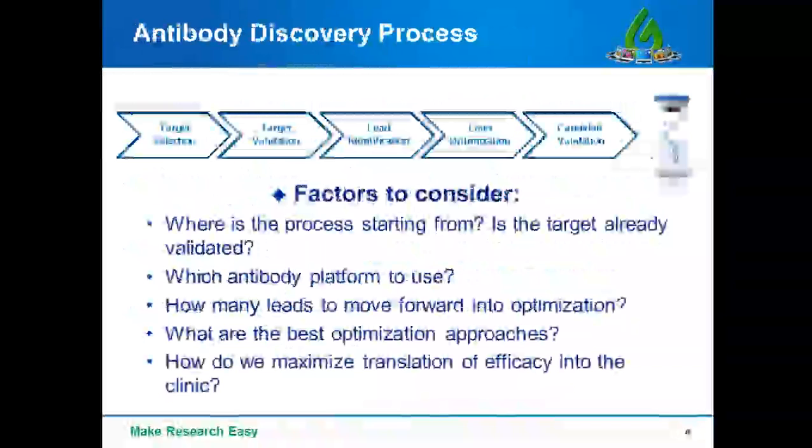Even before animal immunization, plans and preparation of multiple screening methods need to be in place. Reagents for assay development and screening need to be purchased or developed. Proof of principle efficacy assays such as ELISA and functional assays such as ADCC or CDC or proliferation assays may need to be developed and validated.